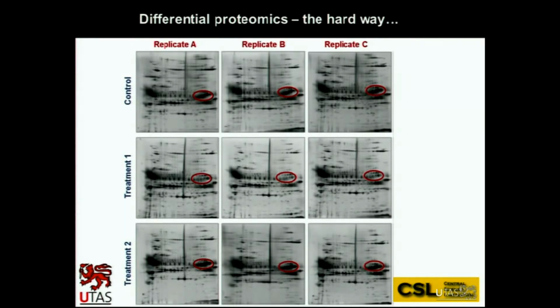So here I've highlighted these proteins which are present in the controls and in this treatment set, but are depleted in this treatment set. So here the emphasis is on protein separation. And then these spots can be excised and then analysed and hopefully identified using mass spectrometry.